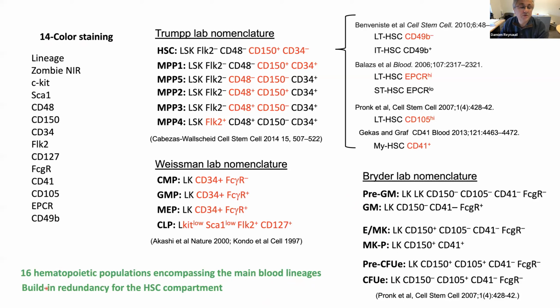This staining also has built-in redundancy for the HSC compartment. This way you can compare the stem cell compartment as it has been defined by multiple laboratories in the literature.